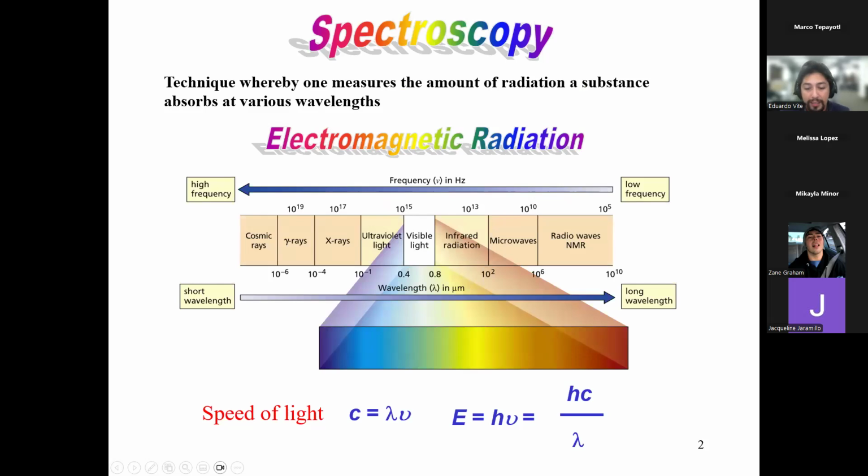So spectroscopy, it's a Latin word composed of two parts, spectro meaning image and scopy meaning to look, like a telescope. So this is simply we're looking at an image of a molecule, and more specifically, we're measuring what happens to this molecule when we shine electromagnetic radiation on it. There's different areas of electromagnetic radiation. Us human beings, we have eyeballs, and we can only see a very, very small fraction of electromagnetic radiation. We can only see visible light, which is usually 400 to 700 nanometers.